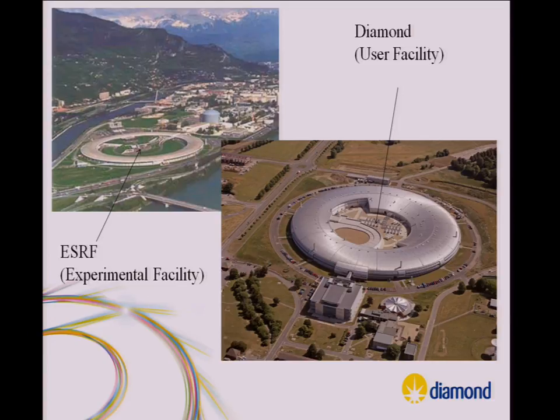All the visualization is just happening on this machine, and what we're trying to do is, if you're interacting with very big files like these gigabyte files, fundamentally you only need to have in memory what the user needs to color each pixel. So if you're making a GUI app, you don't need a lot of the data in memory. It's about all the time trying to code it in a really abstract way. The code becomes very different when you haven't got the memory to visualize what you're trying to look at.